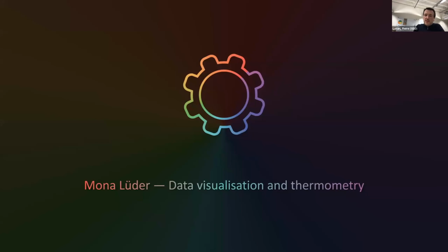Thank you very much, Mona, and also thank you, Renée and Thorsten, for those presentations and for showing us what we can do with XMapTools 4.3. I want to quickly summarize what we have shown you today. We have shown you that we can use XMapTools 4.3 to do the data reduction of LA-ICP-MS for maps, that we have tried to improve the data compatibility, but there is still work in progress, and in the next version, we will be able to read even more data.